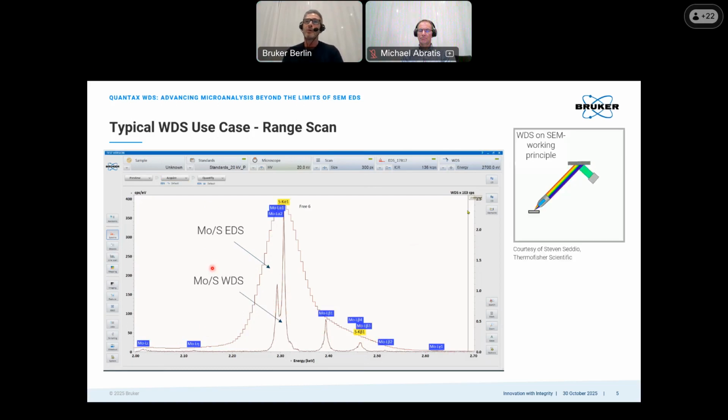And here you can see what's happened inside the instrument during data acquisition. We have our mirror optic, which stays fixed in space, so it doesn't change with the X-ray energy. The only thing that changes is the crystal, which is mounted on the crystal turret. The theta angle will be changed, and also, as we have learned, in order to satisfy Bragg's law, the angle of the detector relative to the crystal needs to be adjusted.